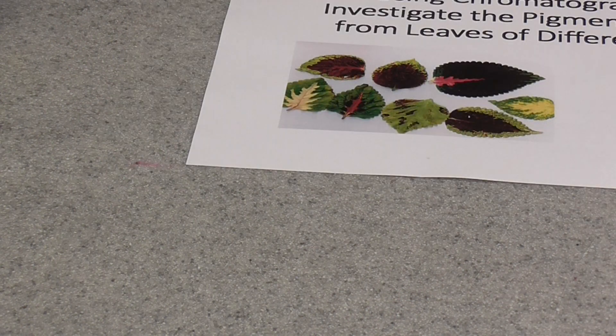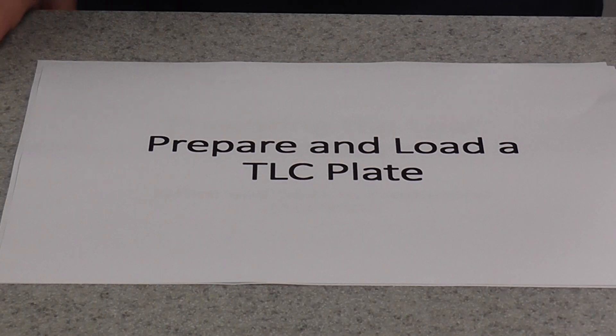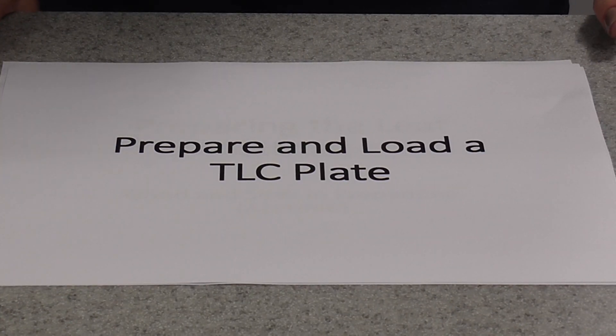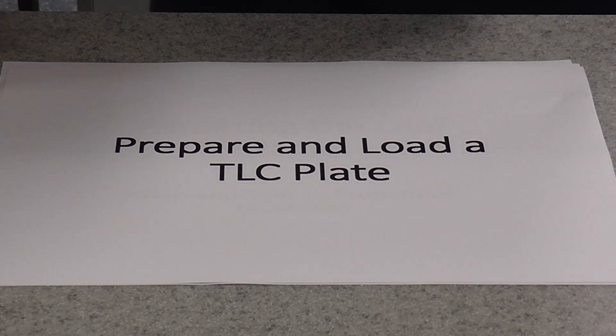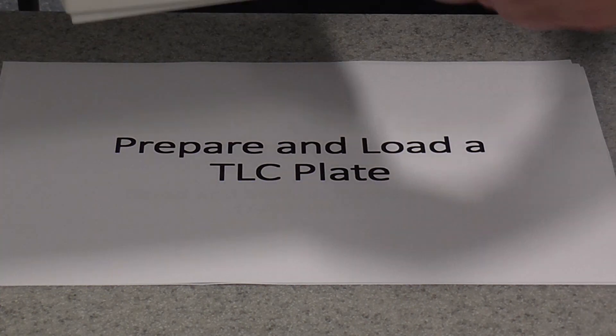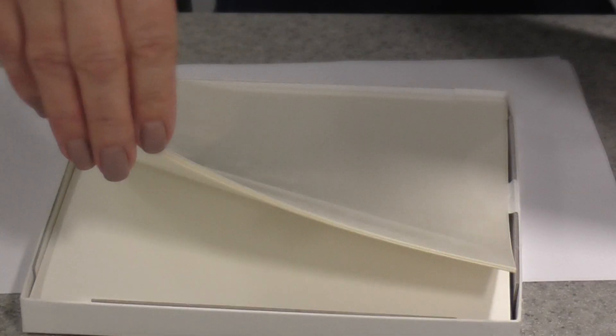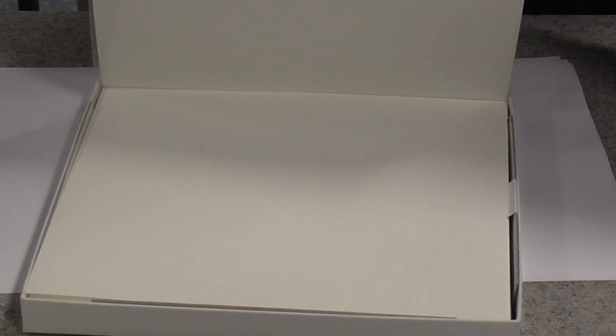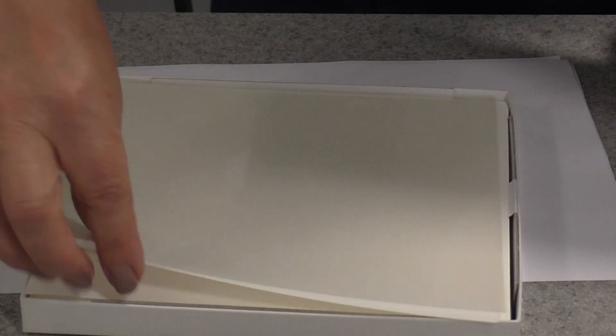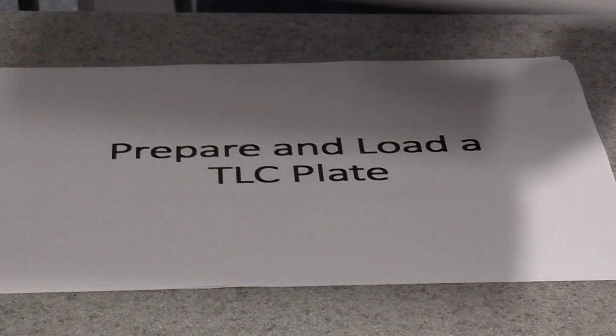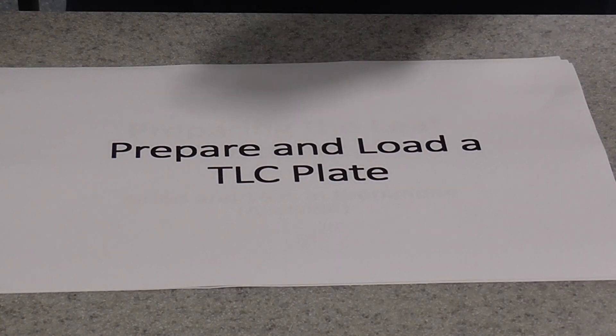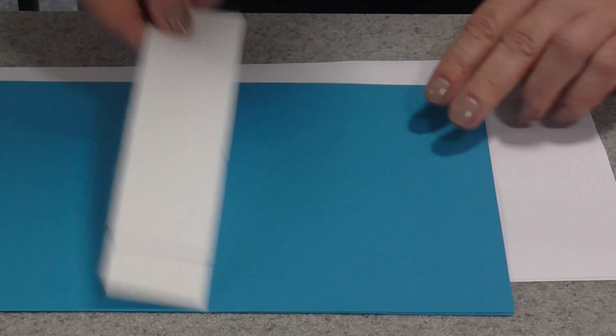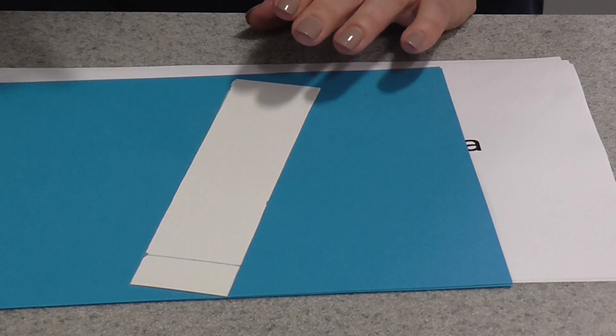The next thing you're going to do is prepare and load a TLC plate. You can use chromatography paper if you like, it doesn't work quite as well, but it does work. A TLC plate is actually a sheet of plastic coated in a silica gel. You can buy them in boxes. That's the stationary phase used in chromatography. Get yourself a TLC plate and cut it into some little strips. The best size of strip to use for this is about 20 centimeters by about 4 centimeters.